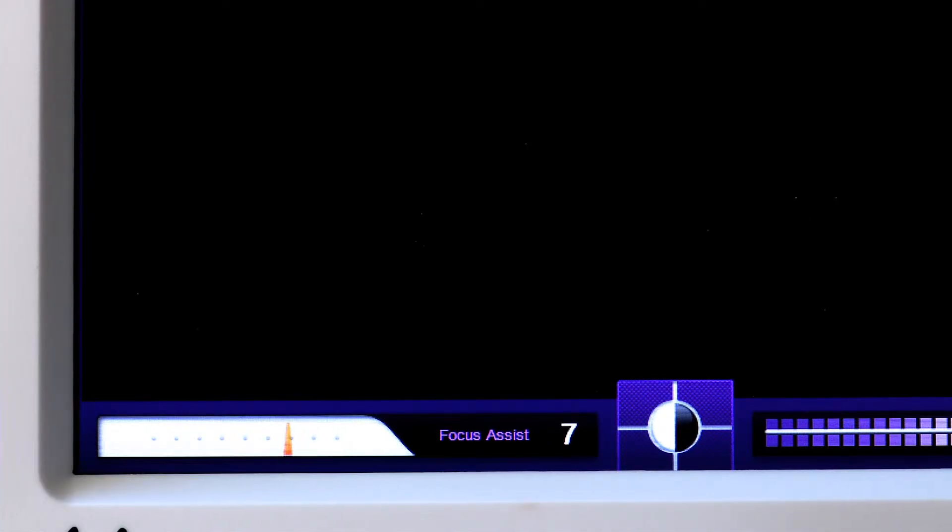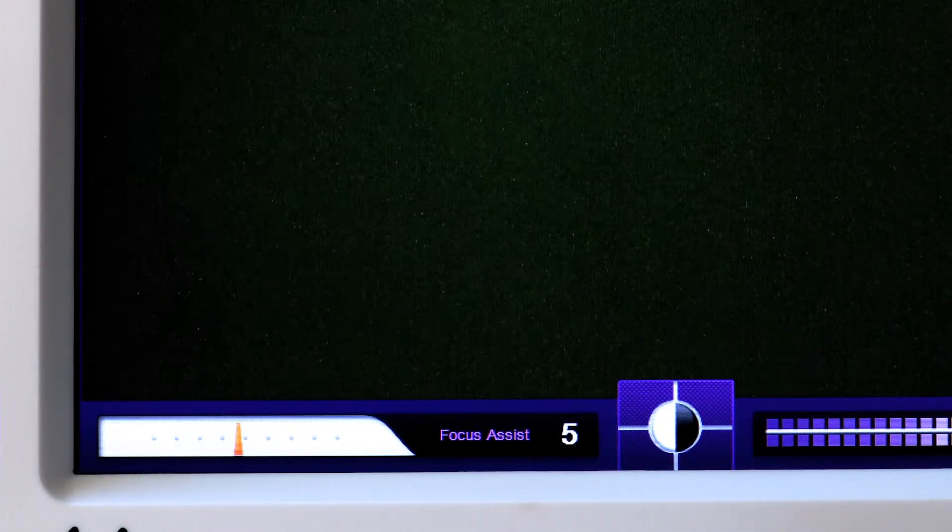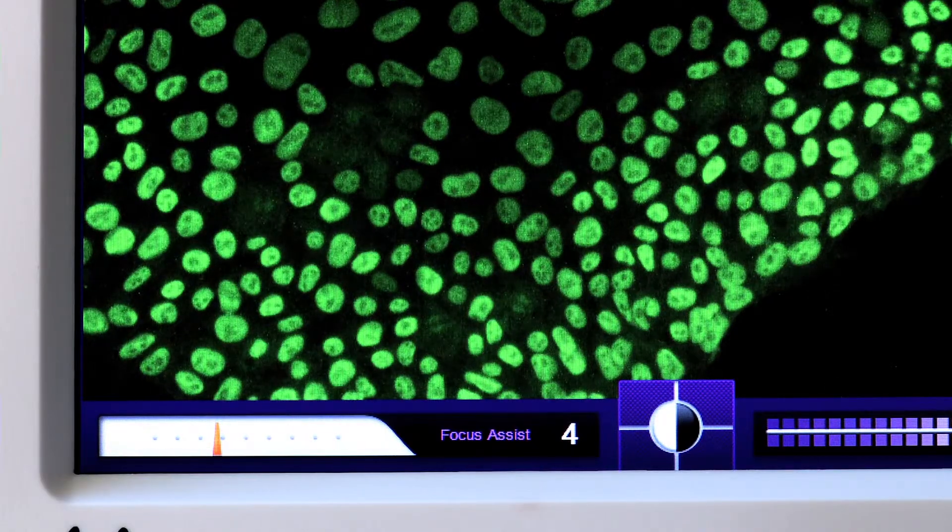The single hardest thing I've observed is people have a really hard time focusing on a sample. They'll turn the knob one direction, hit a stop, see nothing, and have to crank back all the way. So we put an analog switch on there that goes from 0 to 10. If you walk up with a flask and you're focused at number four, the next time you walk up with that same flask, put it at number four and you're in focus and off and running.